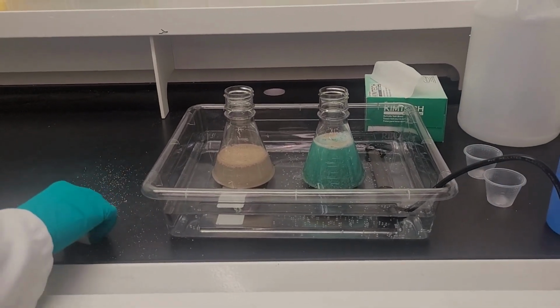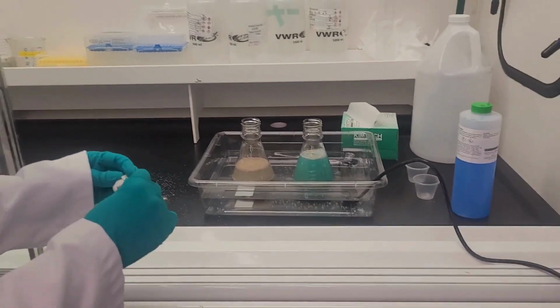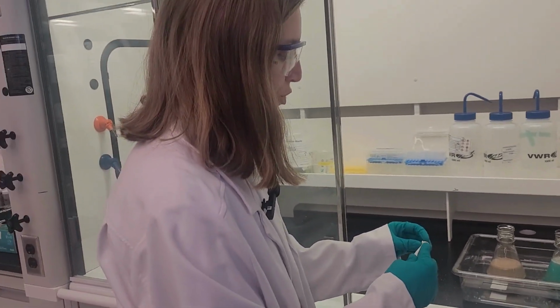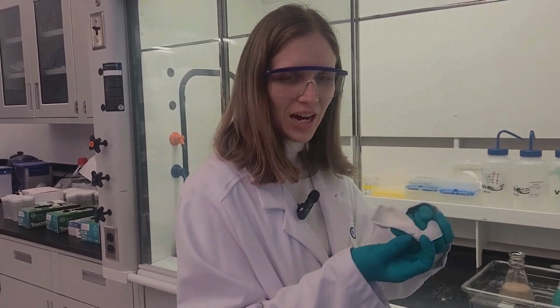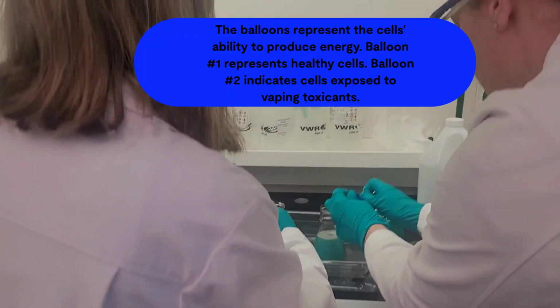So now we're going to add balloons to these flasks because as the yeast produce energy, they release a gas called carbon dioxide that should help fill up these balloons.